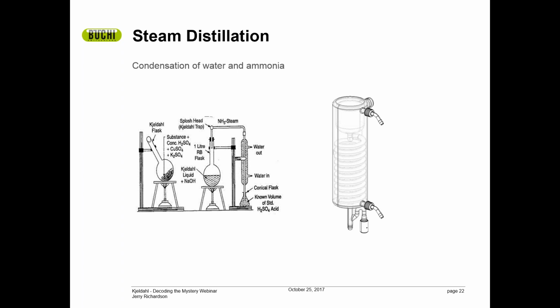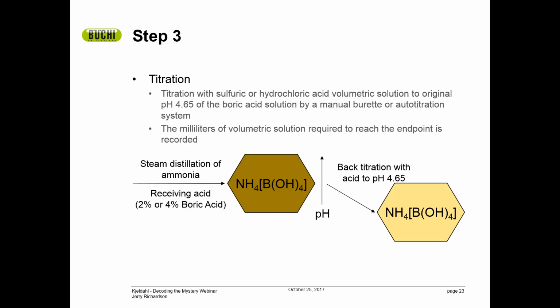Tap water, a lot of people also can't really allow water to just run down the drain. So if you work in California, you are looking at a chiller. But the ideal is to have the water temperature for the condensation between 18 and 19 degrees C, and it's a very good system to run. You can go as high or as low as 16 and still have very good return without having problems going the other way where we're condensing too early. So advantages, a little bit of optimization will go a long way toward making sure that we get all of the ammonia to come over, and it's very simple and easy to understand.